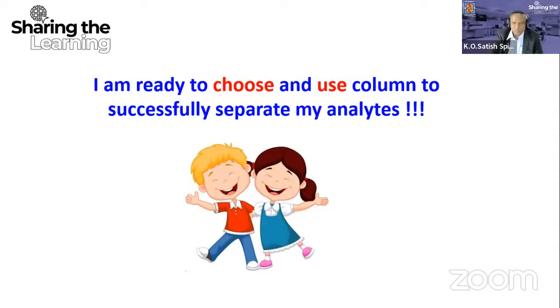Yes. So coming down, sometimes my compound's RT is shifting a small amount when increasing the concentration. Is it due to the column or any other issue? This is a question from Tirumalai. No, the question is not clear, because unless we know the details of the columns they are using, it's very difficult to answer this question. Okay, we can take that question separately.